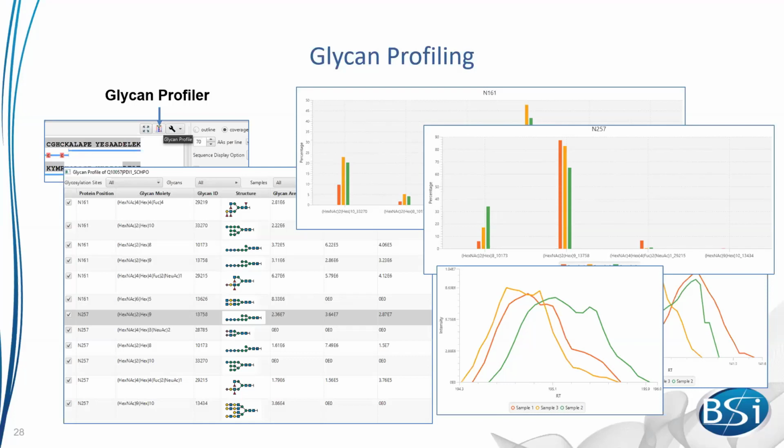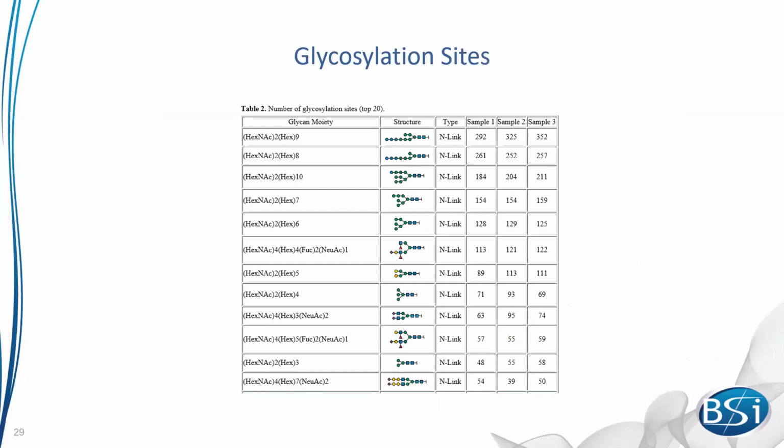We have a few other statistical information in other places. One is the glycosylation site summarization table, which we can see in the summary page. This summary table contains only the top 20 glycans, and summarizes our findings in the total analysis. This table can be exported, and the exported file will actually contain not only 20, it will contain the complete list.